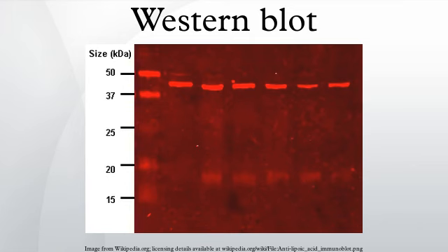2D gel electrophoresis. Two-dimensional SDS-PAGE uses the principles and techniques outlined above. 2D SDS-PAGE, as the name suggests, involves the migration of polypeptides in 2 dimensions. For example, in the first dimension polypeptides are separated according to isoelectric point, while in the second dimension polypeptides are separated according to their molecular weight.